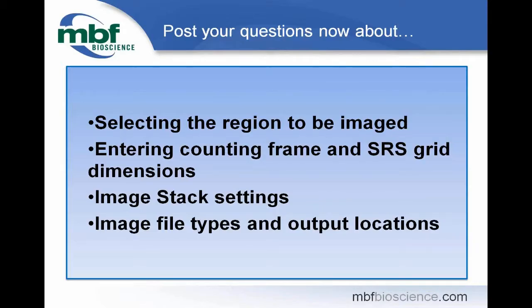At this point, I'd now like you to post your questions regarding selecting the region to be imaged, entering counting frame and SRS grid dimensions, image stack settings, or image file types and output locations.